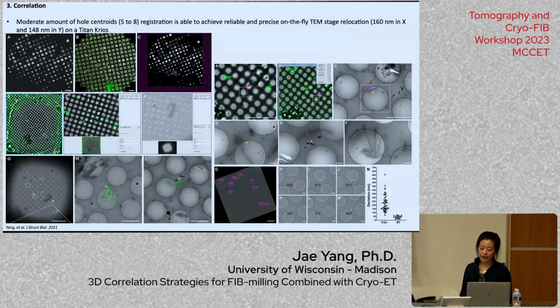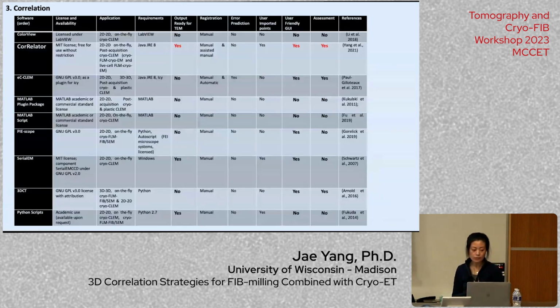And one thing that I also sometimes use is that because the coordinates file you identified have the stage position already, you can actually use it as your SPA coordinates where you collect data, which actually worked. And then this is just to go through all of the statistics and show you that it's actually very close. So just some comparison with other software packages, because this field has been developed for years, and everybody in the community contributes a lot in this process.